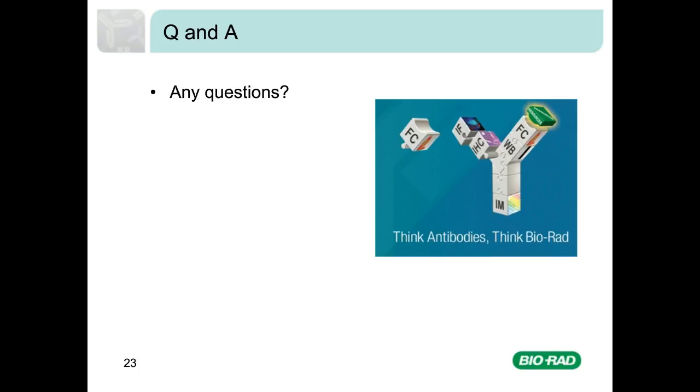The next question is, is it possible to compensate manually with double staining, or can you only do this for single staining? Well, you can only compensate with single staining because you need to use a single fluorophore to measure the spillover into each empty channel. If you use double stain cells, it's going to skew the results and produce the wrong values.